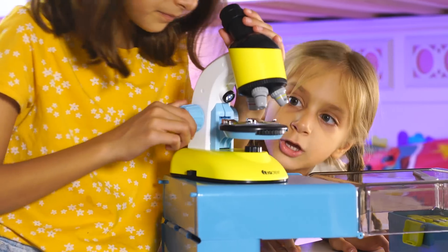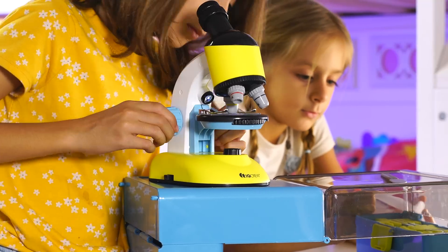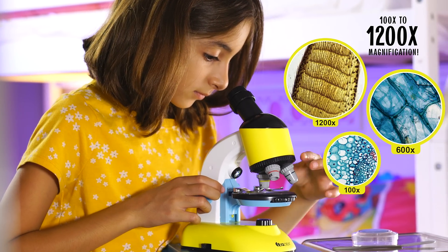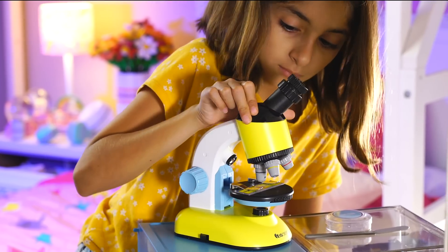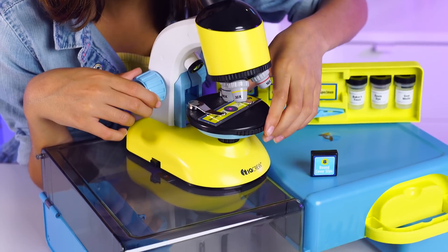The microscope features a durable ABS frame built to last, high-quality objectives, and up to 1,200 times magnification, ensuring a clear view down to the cellular level. The dual LED lights make samples come to life, while the rotating head and adjustable eyepiece provide crystal-clear images.